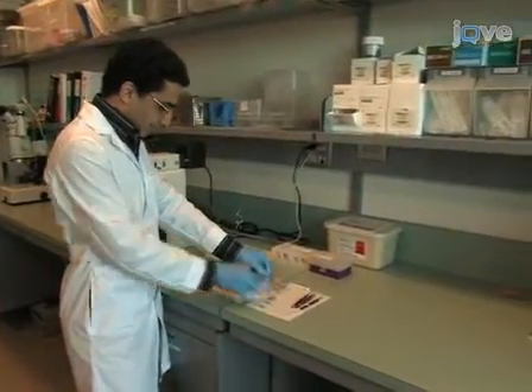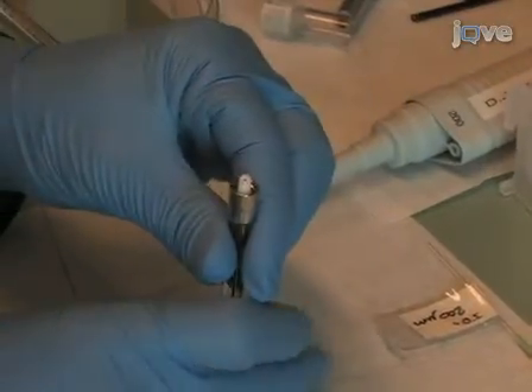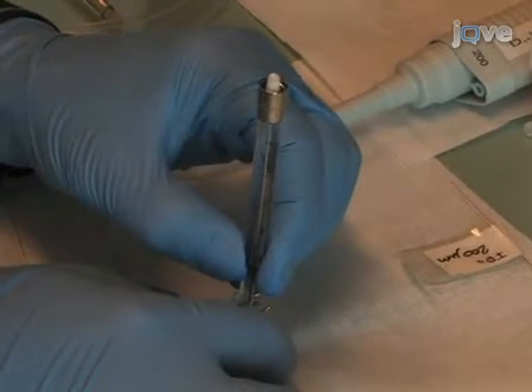To start this protocol, plastic syringes and needles are used to fill gas-tight glass syringes with reagents, ensuring that no air bubbles are present. Typically, we use a 1 to 10 microlitre syringe for injection and a syringe with 5 to 10 times larger volume for aspiration.